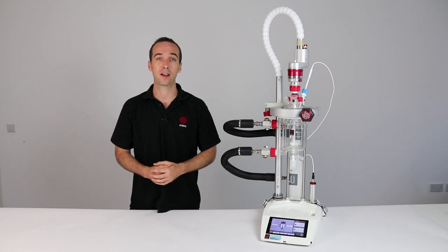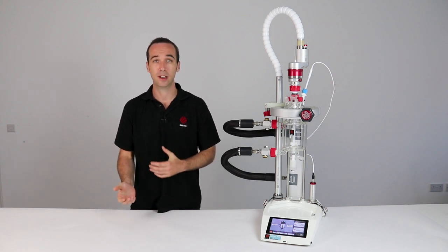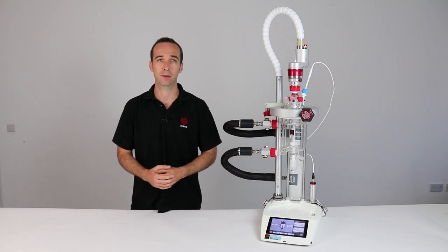Hi, I'm Stephen from Sirius and today I'm going to be talking to you about the Atlas HD. The Atlas HD is an automated modular jacketed reactor system and allows you to scale your chemistry from 50 milliliters to 5 liters on a single platform.